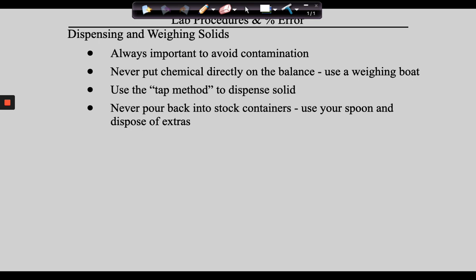And then here's how you do this. Put your elbows on the counter and then hold the scoop above the weighing boat and you tap on it. And as you do, you're not watching the salt, you're watching the display. And as you do this, you're dispensing salt, dispensing salt, dispensing salt. You're creeping up on a gram.